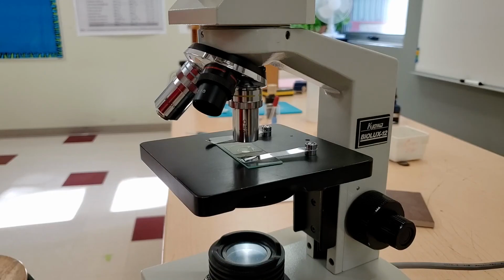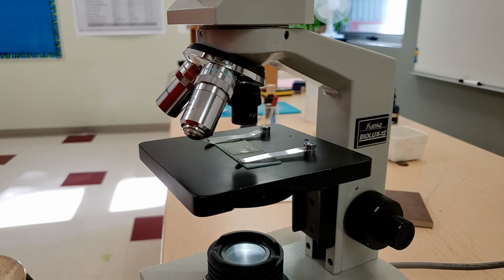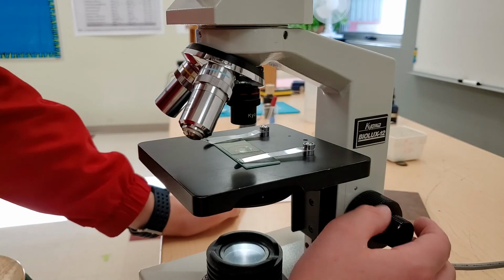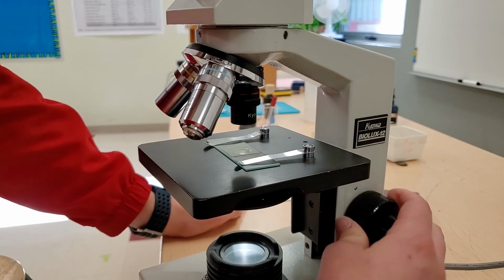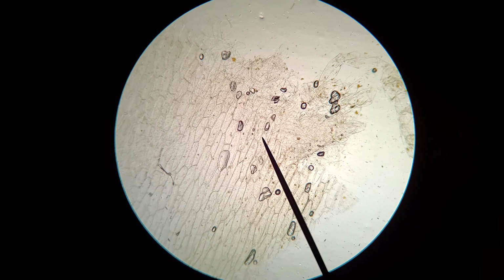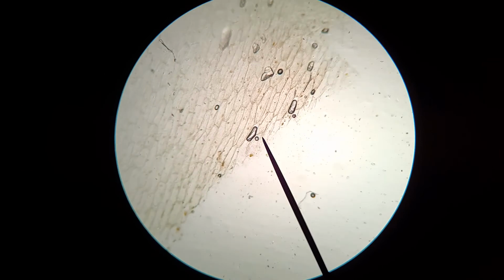So we will make sure the microscope is on low power, and we will put the slide on the stage and secure it with the stage clips. When we look at our sample through the ocular lens or the eyepiece, we have to bring our sample in focus with the coarse focus first, and then we can move the sample around on stage to find a good example of a cell.